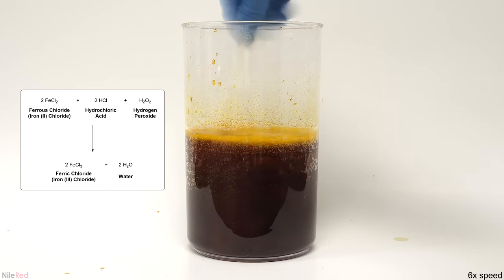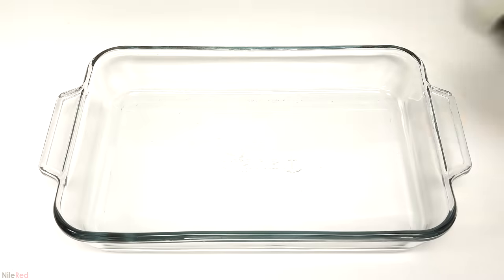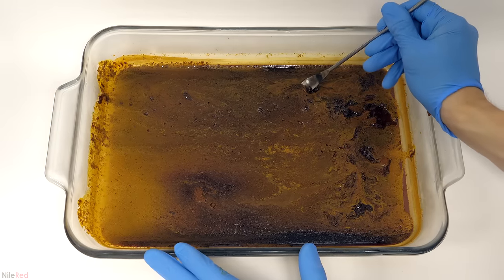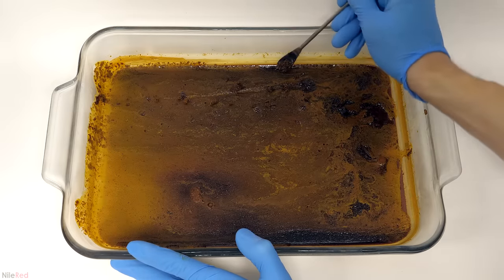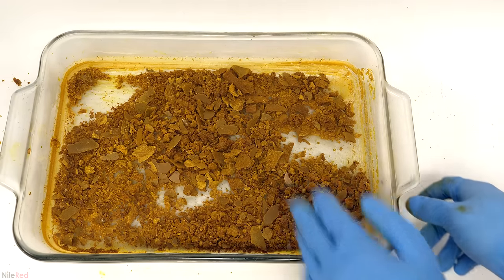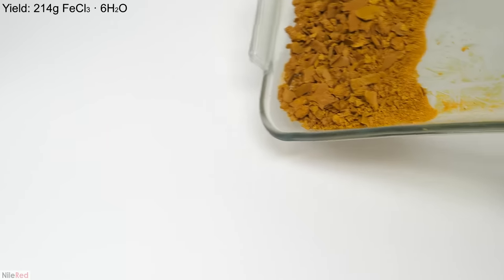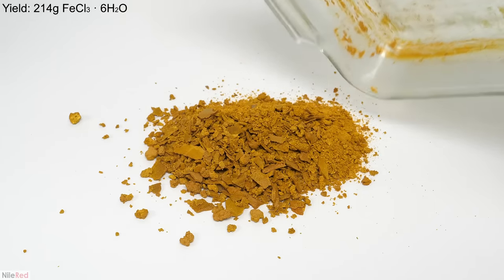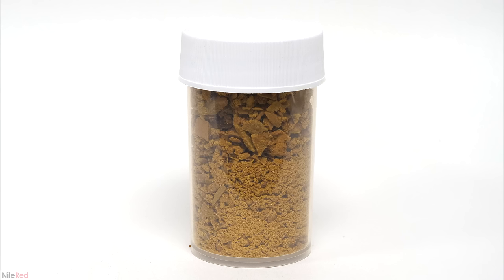This iron 2 chloride was then oxidized to iron 3 chloride using hydrogen peroxide. It's also possible to oxidize it by bubbling air through it, but that process is kind of slow and this method is way faster. The moment it was added, a yellowy-brown color appeared, which was the iron 3 chloride. In total I added 550 ml of the 3% peroxide, mixed it around thoroughly, and poured it into a large dish. I set up a fan off screen and let it evaporate for a couple of days, then scraped it off the dish. The entire drying process took about 3 days air-drying, but I could have sped it up in the oven. The final yield was 214 grams of iron chloride hexahydrate, meaning that every iron chloride has 6 water molecules associated with it.